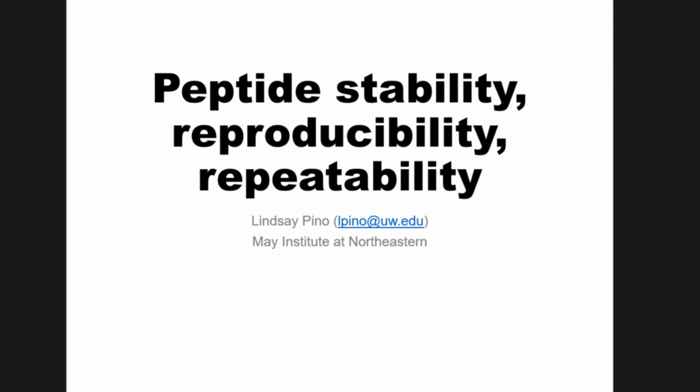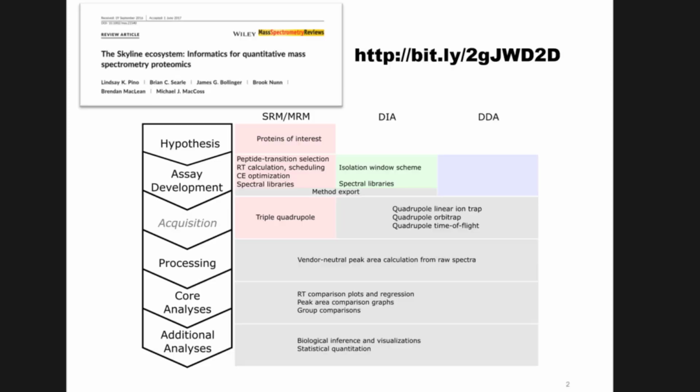So we kind of ended yesterday with the idea that we had some sort of hypothesis. If you got a chance to get to that plasma tutorial, that's great. And if you didn't, the whole idea with the plasma tutorial was if your boss, or for some reason you, came up with some set of 6 proteins, including a lot of the apolipoproteins, how would you go about building a proteomics assay for those 6 proteins?